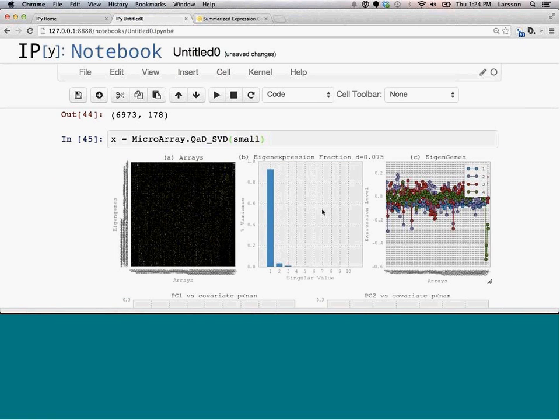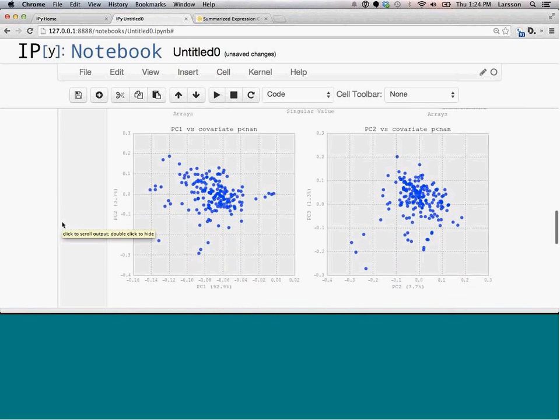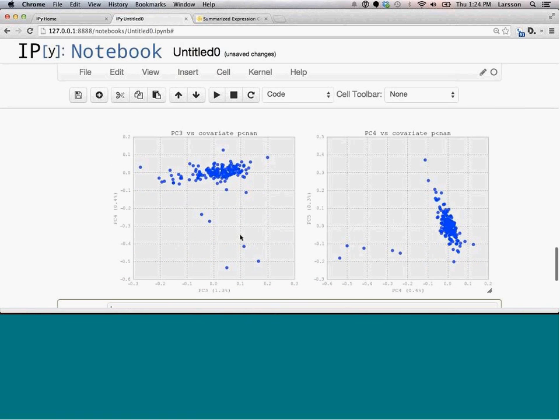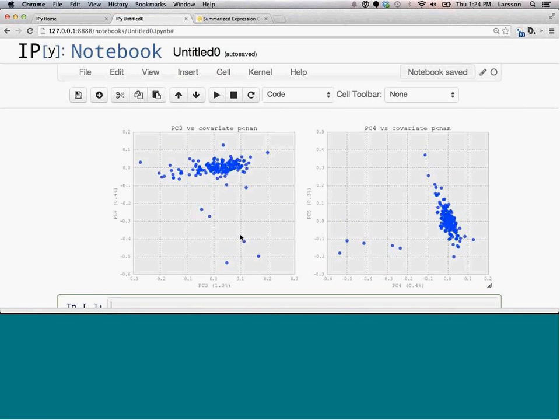And what we see here is that it generates a bunch of things about the quality of the data. This is basically the PCA in summary form, and then the more traditional PC plot, so we can see what the distribution of the data is. It'd be a lot more interesting if we color-coded these by some information, such as the origin or the differentiation method. But this is just showing how easy it is to test the data, do a quick analysis, look at quality control, and equally we could have looked for differential expression.